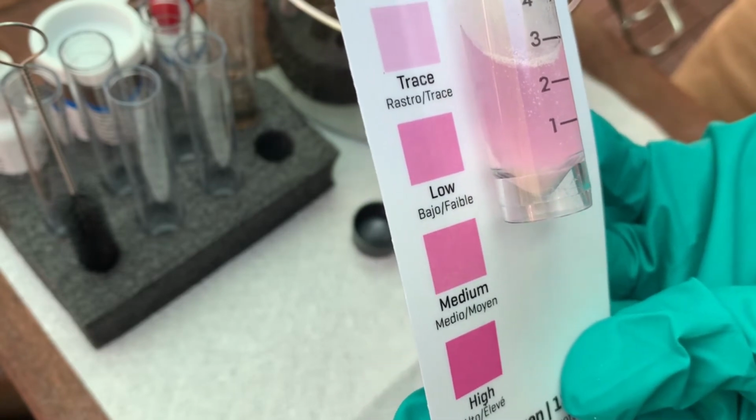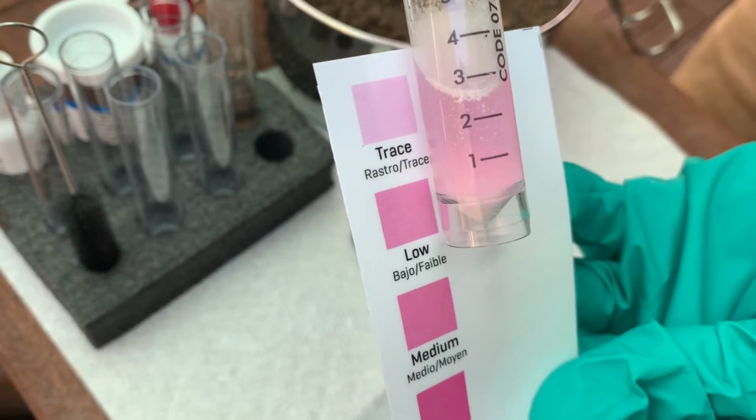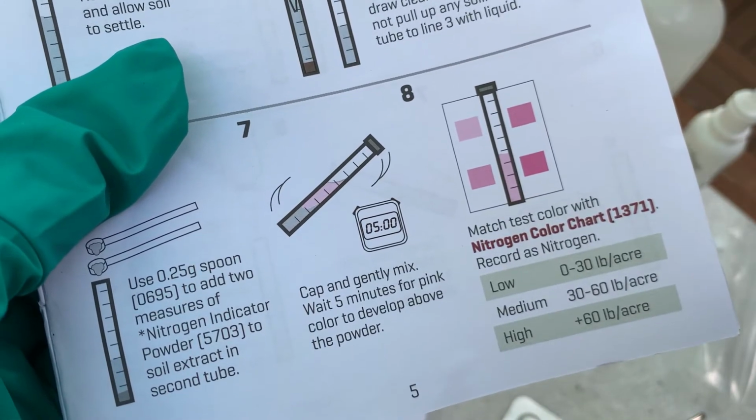That is an easier method than trying to compare it against all 4 colors at a glance. You always want to take 2. And then we take a look at our indicator chart to decide how many pounds per acre we have, if it's low, medium, or high.